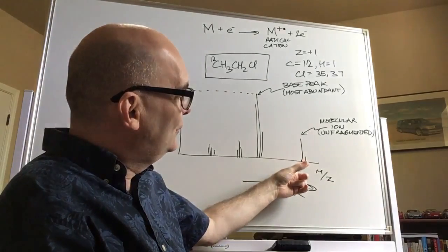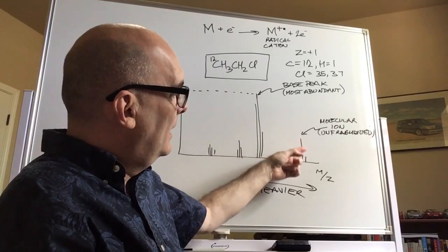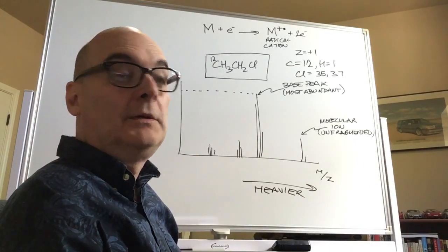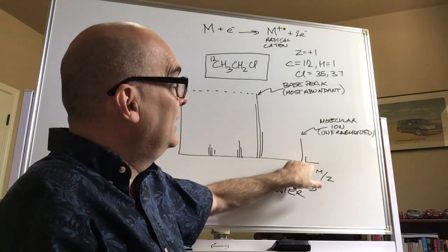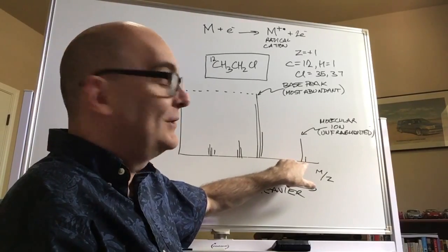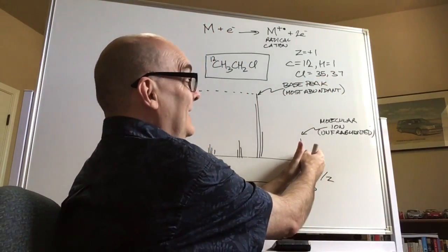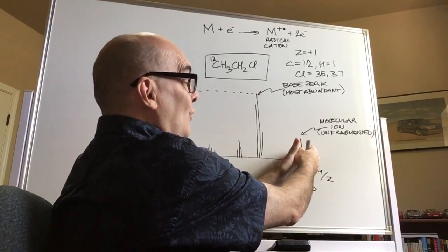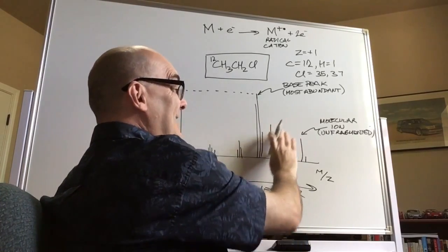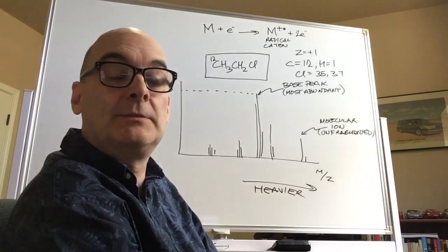And we can use this difference right here to let us know what's going on. When that chlorine is present, there'll be a gap in the middle, and these two lines will be two atomic mass numbers separated from each other. And anything that's holding on to that chlorine when it splits apart will see that fragmentation pattern be consistent.